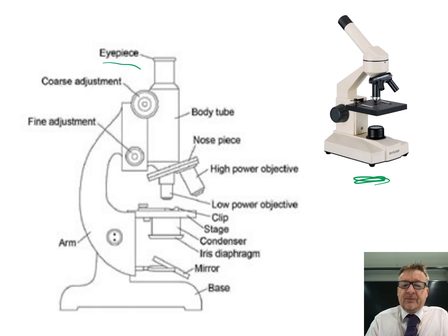Firstly, you've got your eyepiece - that's obviously where you put your eye. It could be times 10 magnification, so the actual lens where you put your eye has that level. The body tube is the structure you look through.